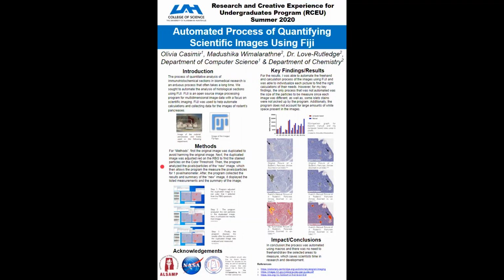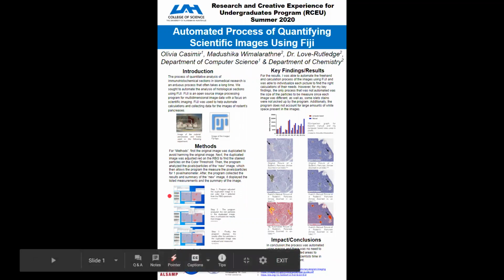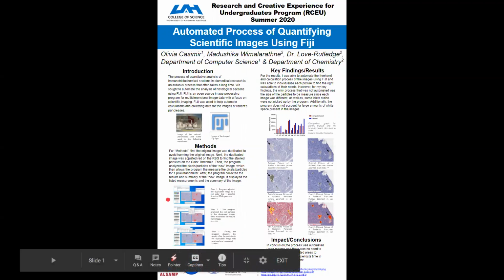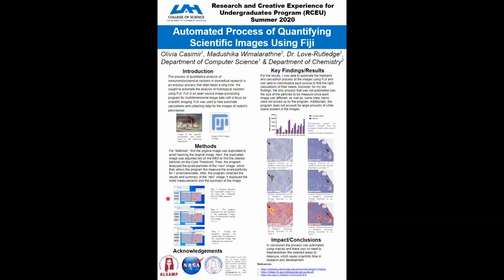For methods, step one, if you look at this picture right here, I use IJ1, which is a language created by ImageJ, so I can better understand the program to create more efficient results instead of using other programming languages such as Python, Java, etc.